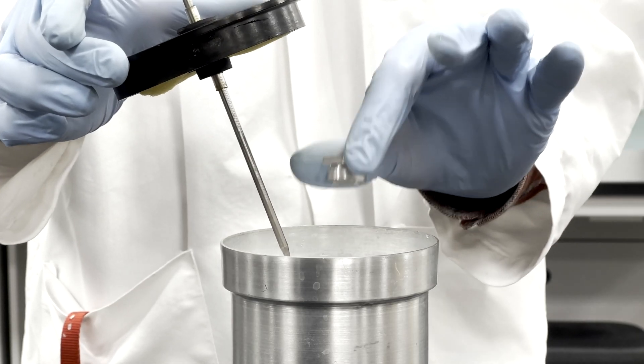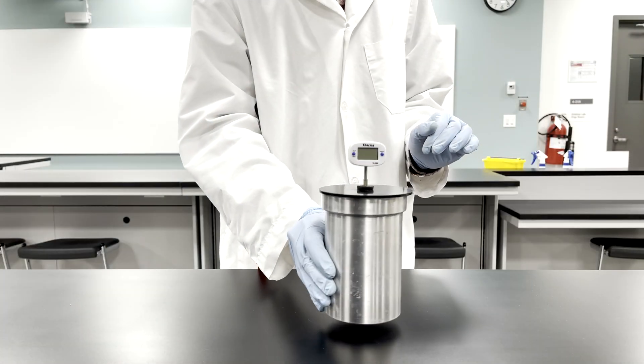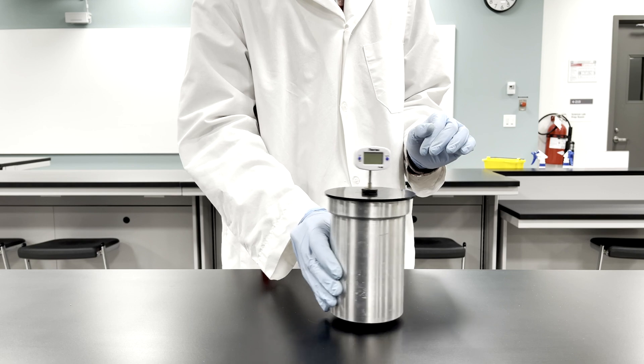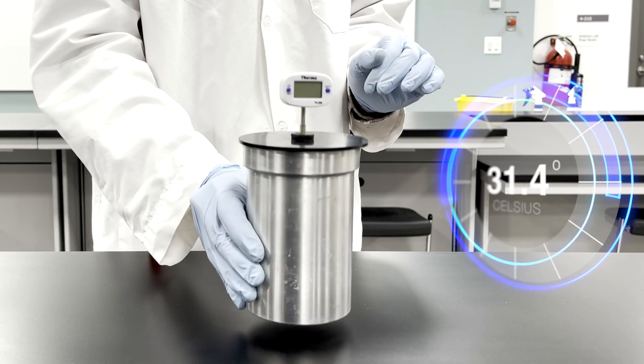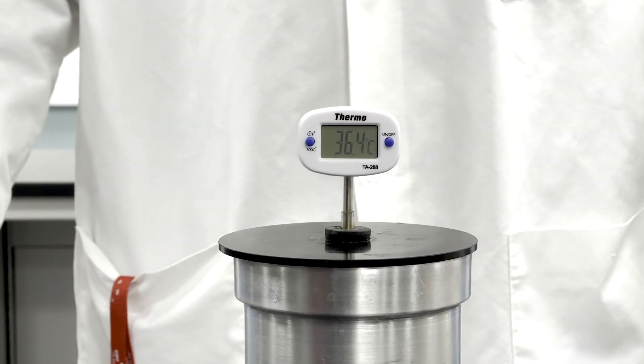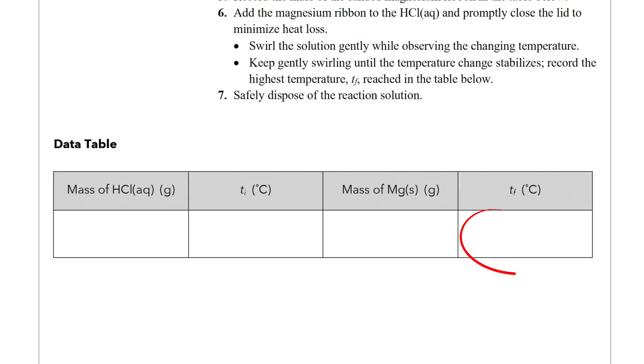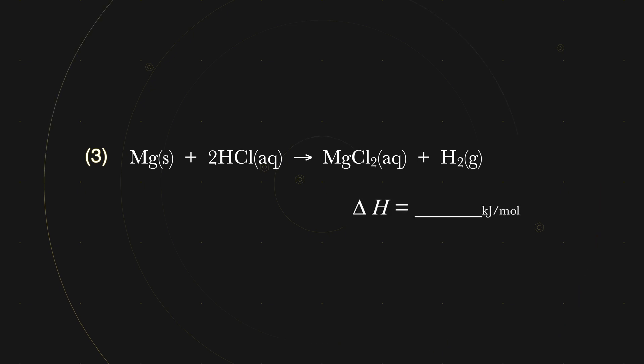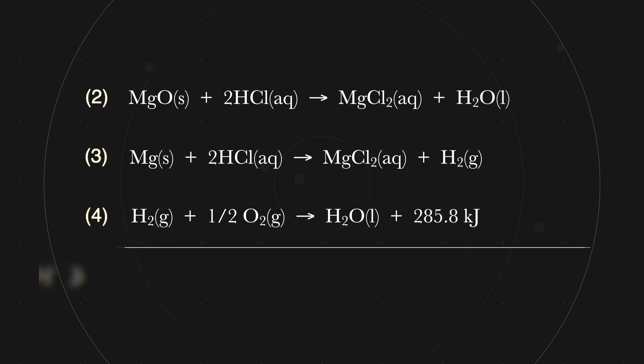Add the magnesium ribbon to the acid in the calorimeter. Again, the solution is gently swirled to encourage the reaction. As the reaction progresses, the temperature once again changes, and we wait until it stabilizes before recording the highest temperature as the final temperature in the data table. Once you calculate the enthalpy change for this reaction, you will be able to use Hess's law to combine all three thermochemical equations to determine the molar enthalpy of formation of magnesium oxide.